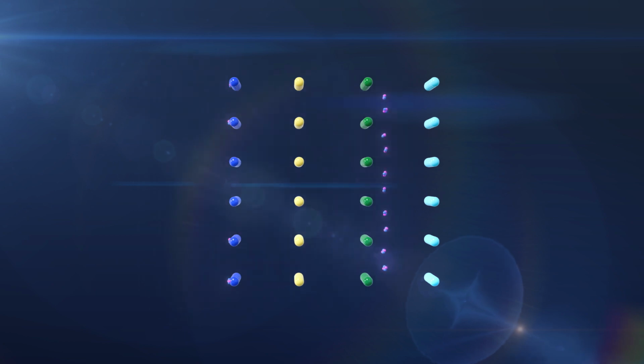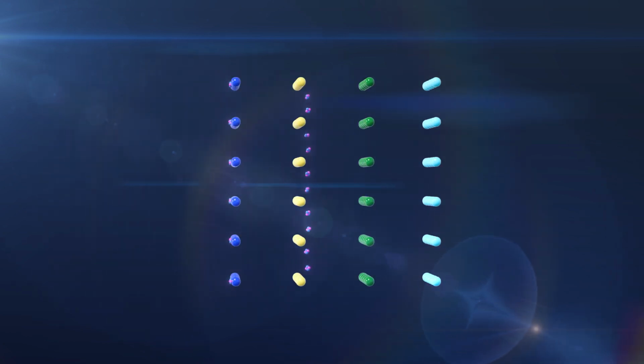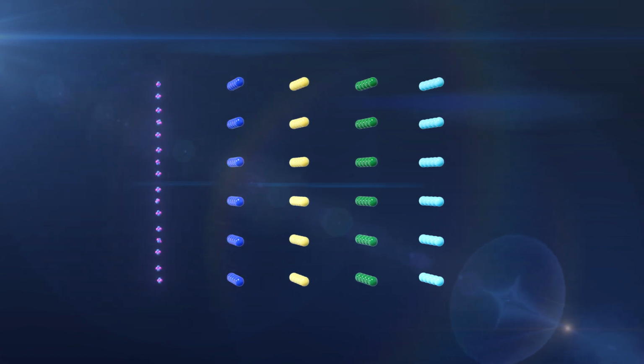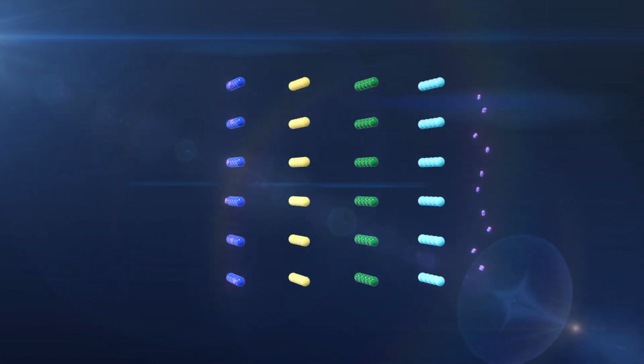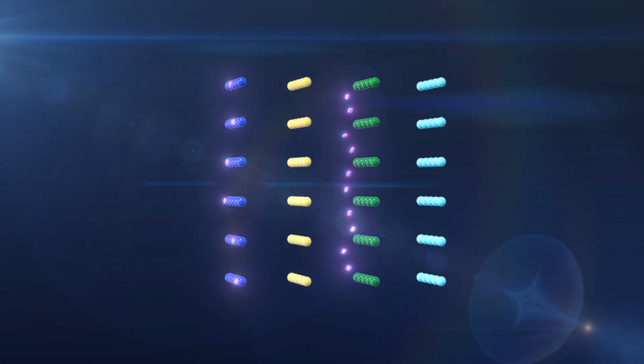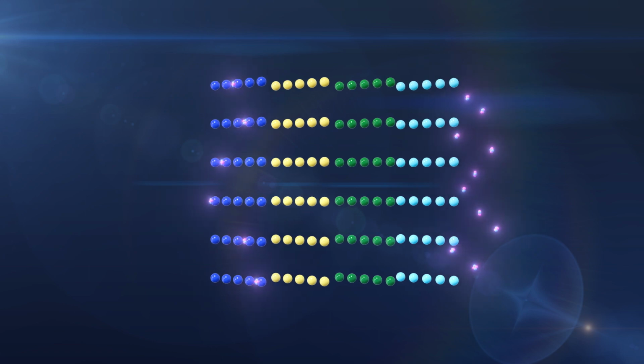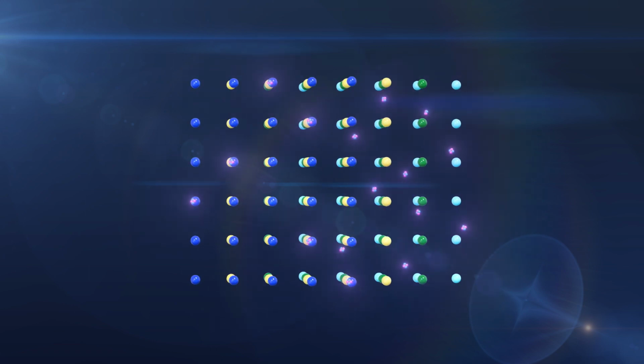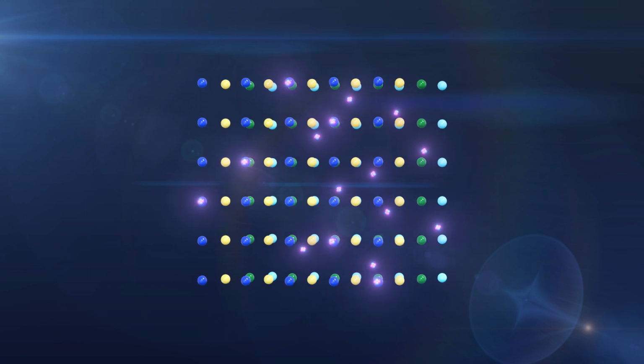Because the atoms of the crystal samples are lined up side by side, when viewed from a certain angle, all atoms except those in the surface atomic layer are hidden by the surface atoms. Therefore, when the incident beam is irradiated in the lattice direction of the crystal, it is scattered only from the surface atoms and atoms that are displaced from the crystal lattice, and the spectrum measured in this manner is called a channeling spectrum.